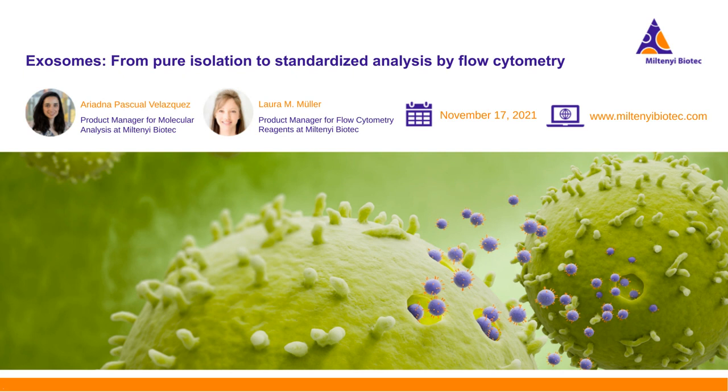Thank you so much. And we have time for two more questions. Can the autoMACS of Miltenyi be used for immunomagnetic isolation of exosomes? I think we do not recommend using the autoMACS for exosome isolation, since it is designed for cell separation. But we have the MultiMACS M96 separator that could potentially be used for exosome isolation. We have validated the isolation with this separator here at Miltenyi, and it works fine.